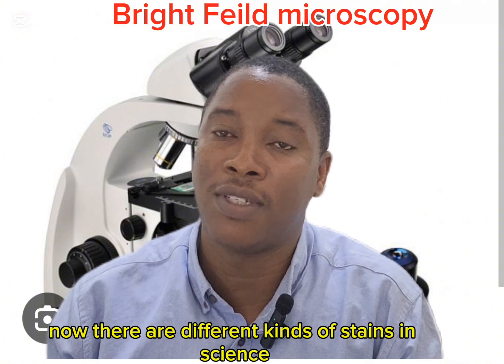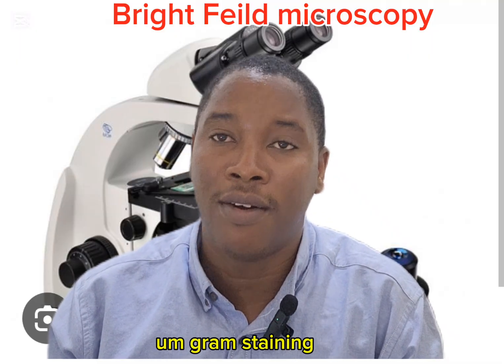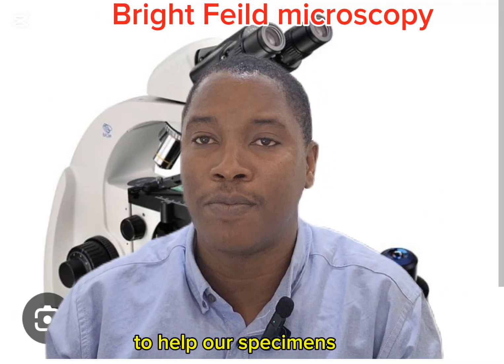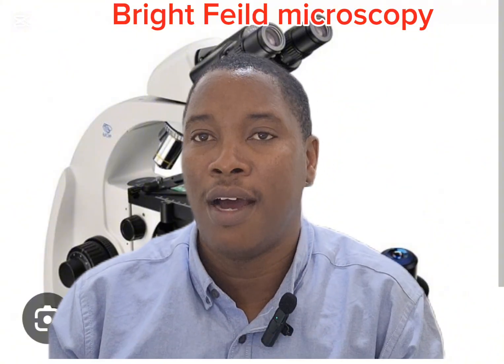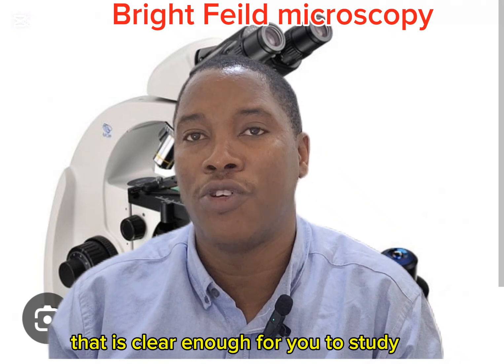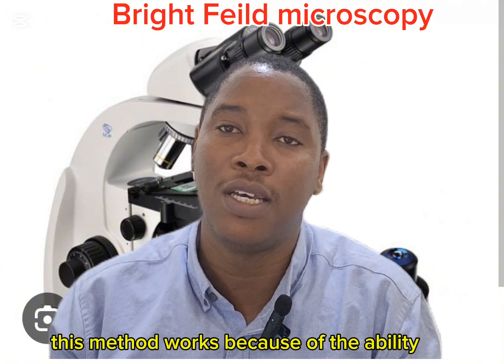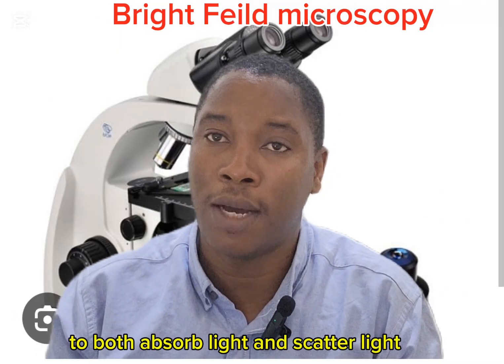Now there are different kinds of stains in science: Giemsa stain, Wright stain, acid fast stain, gram staining. There are many different types of stains. The idea behind staining these specimens is simply to create contrast, to help our specimens absorb and scatter light. Remember that the specimen is an object, and you're trying to create an image from that object, an image that is clear enough for you to study and understand. This method works because of the ability of many parts within the specimen to both absorb light and scatter light.